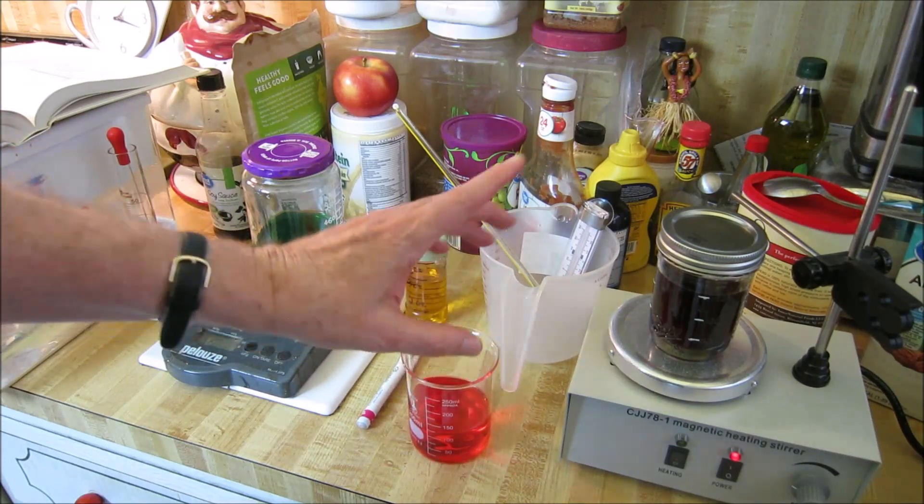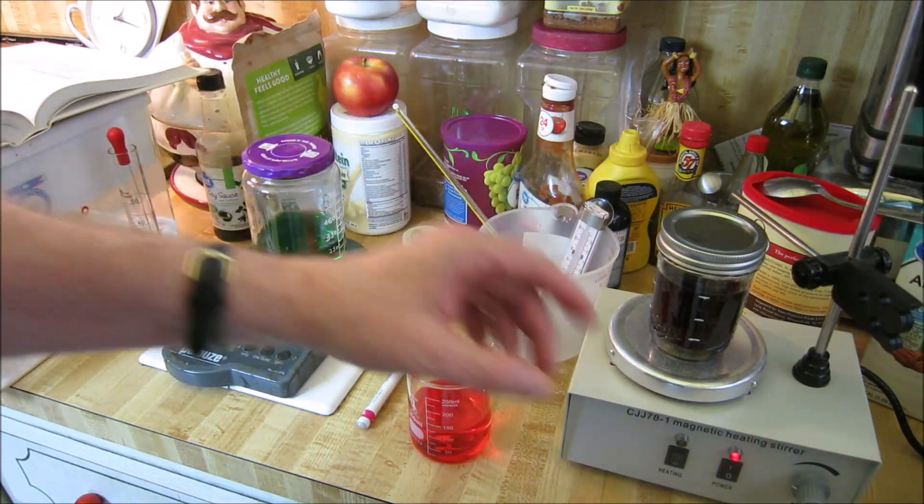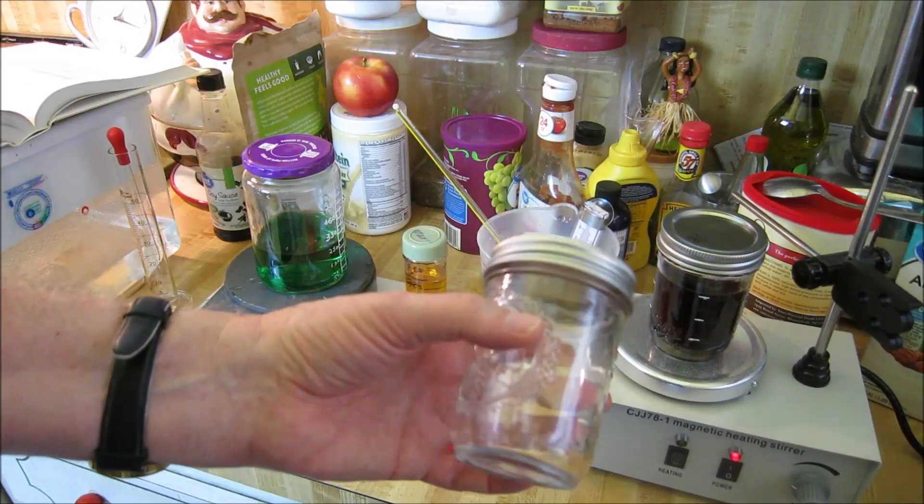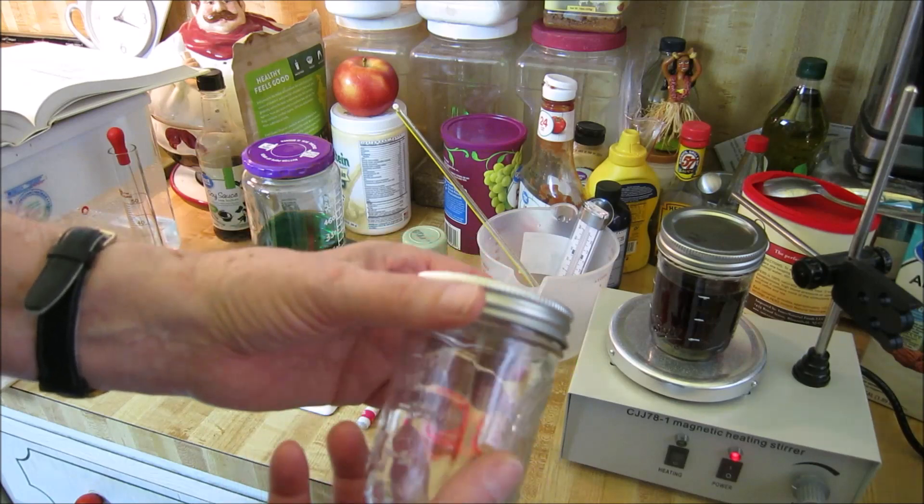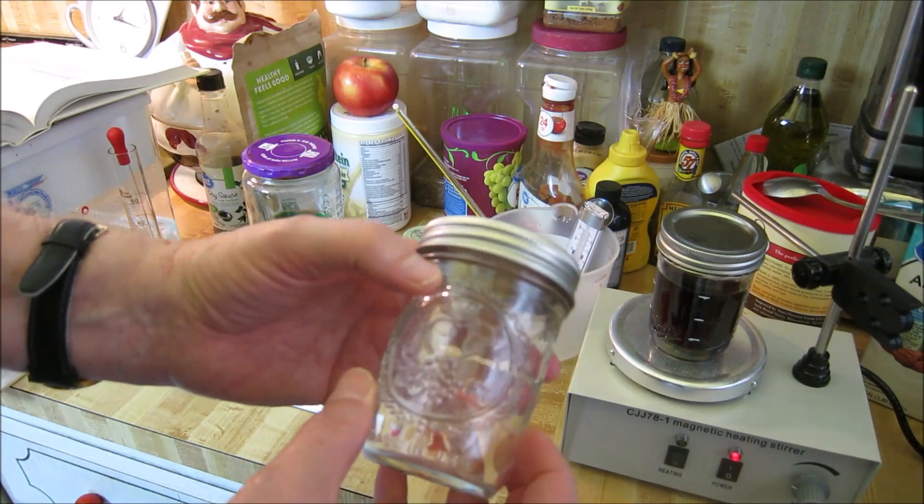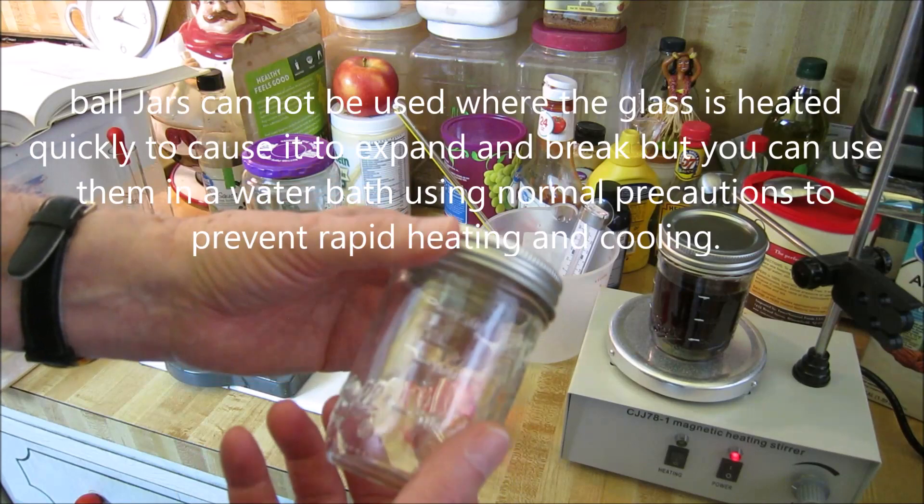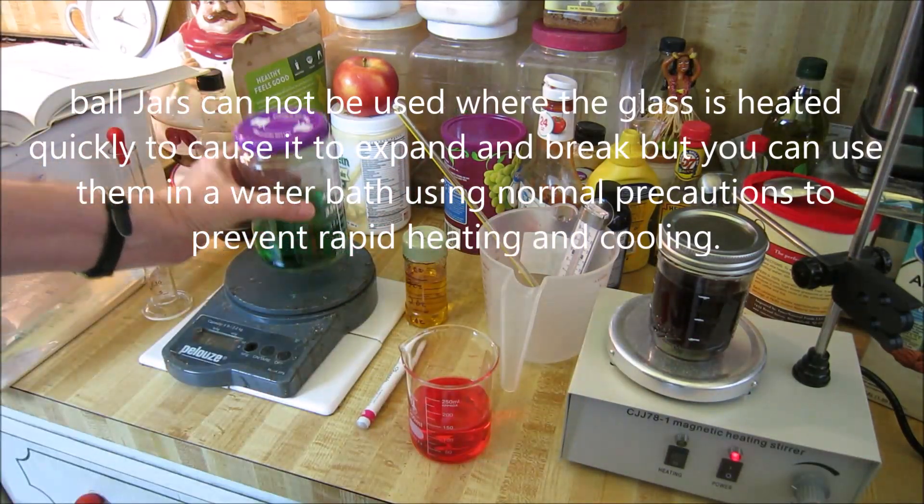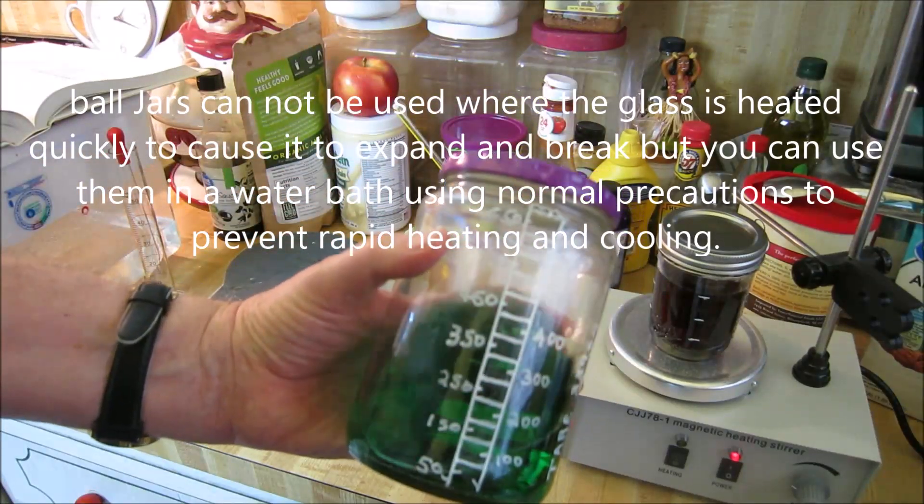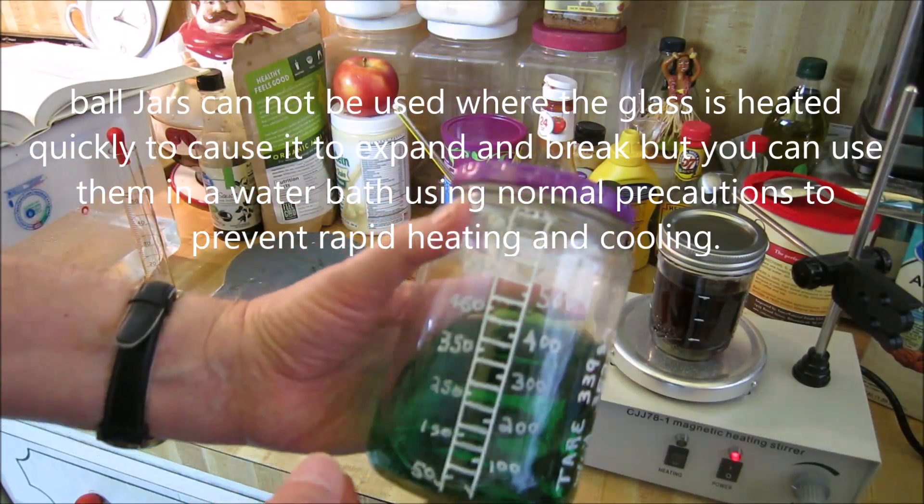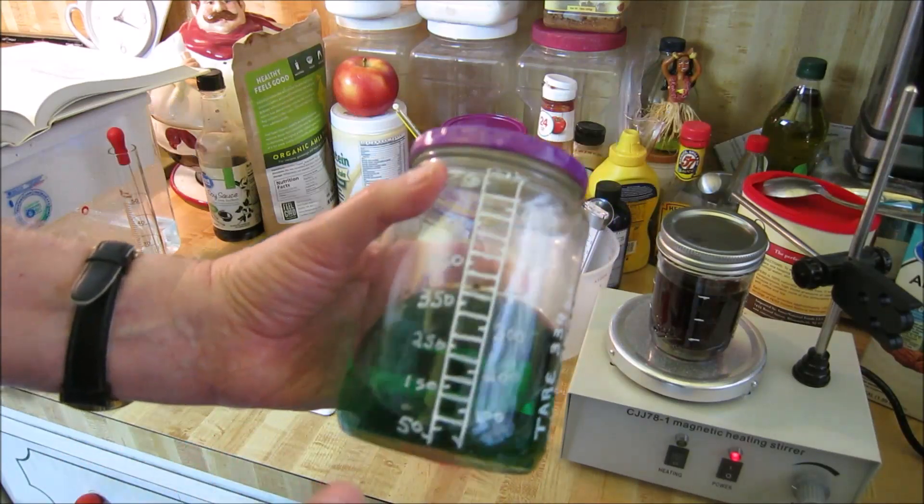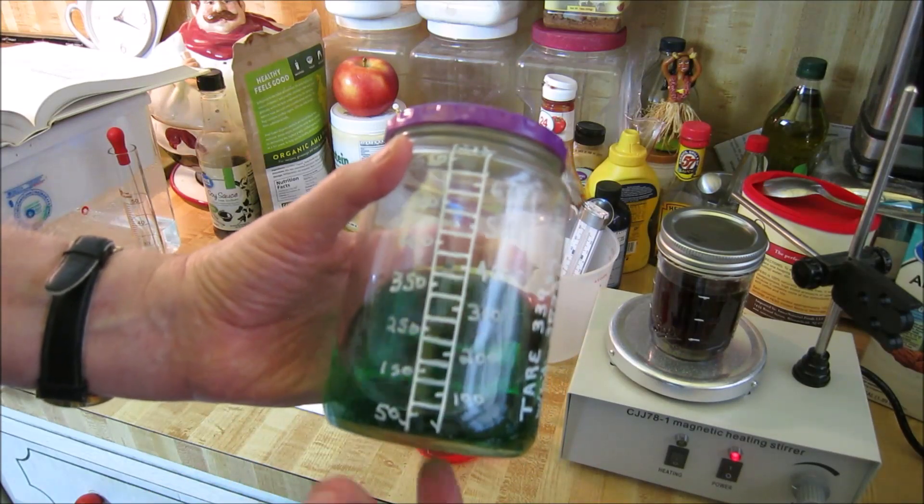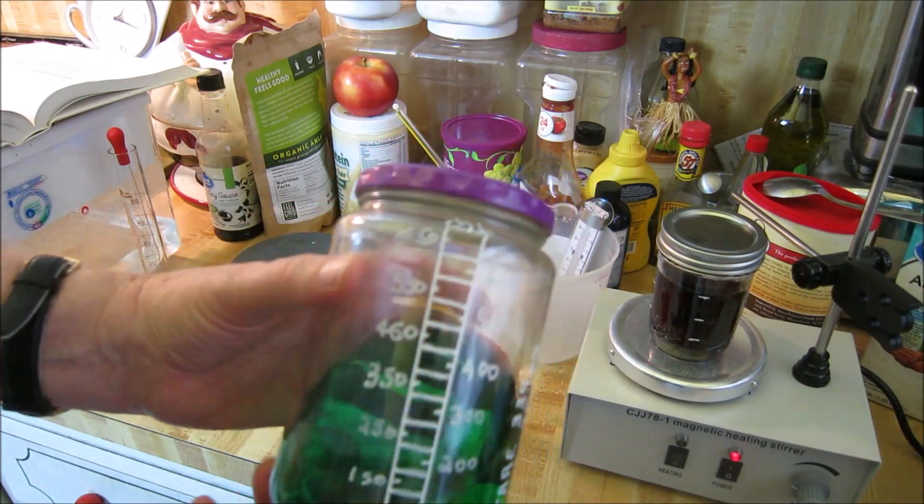However, the ball glass that people use for canning jars, it can also take high temperatures, but I don't think you can put a flame on it. But it can be heated in water baths and so on frequently. You can autoclave and so on. It's a very sturdy glass. But if you're just making stuff to store things that can be stored in glass safely or to measure components to add to others, you're not heating stuff with flame or having reactions in the containers, you can use plain household glassware.